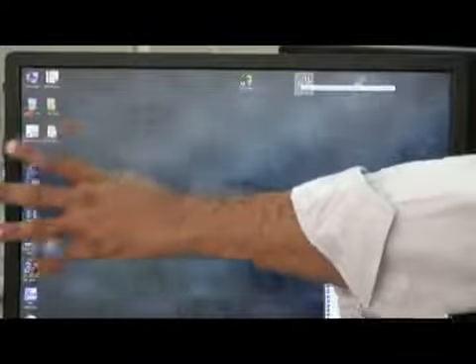This software is the TSQ Tune software. If you want to tune your mass spectrometer or optimize your compound, you use this software. If you want to work with your injections, your routine analysis, you work with Excalibur.